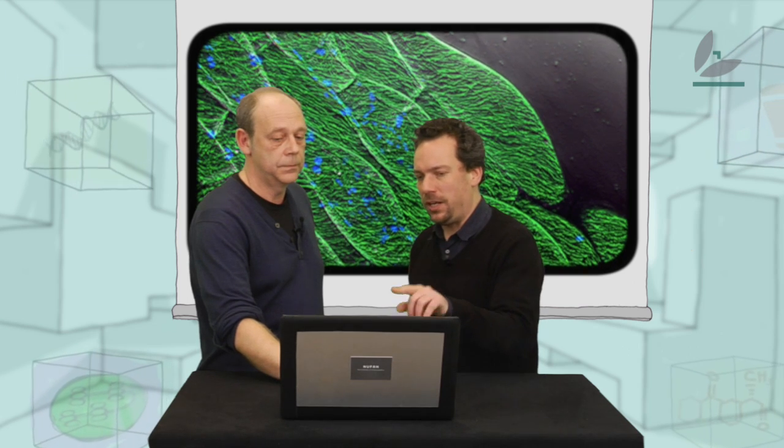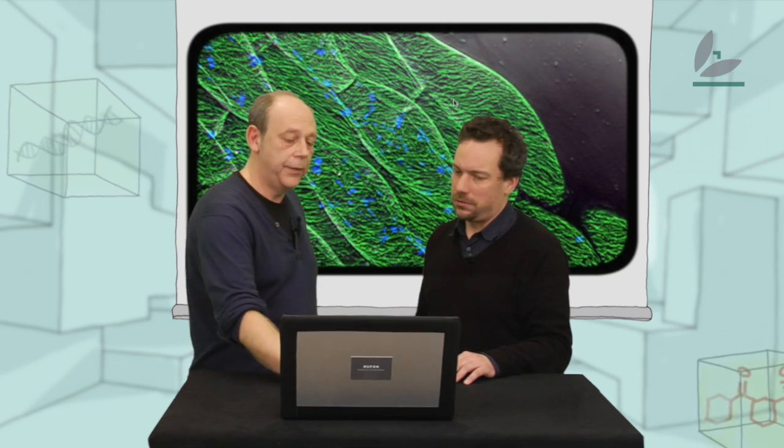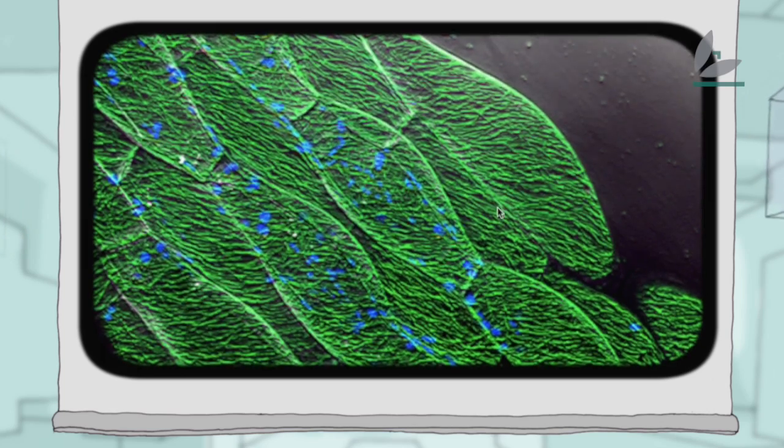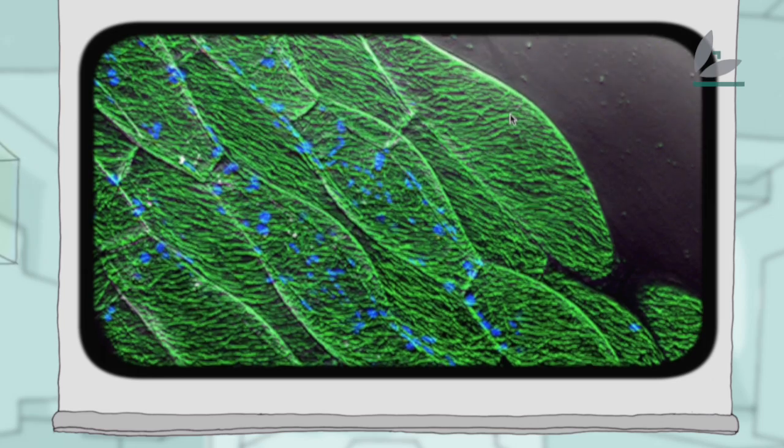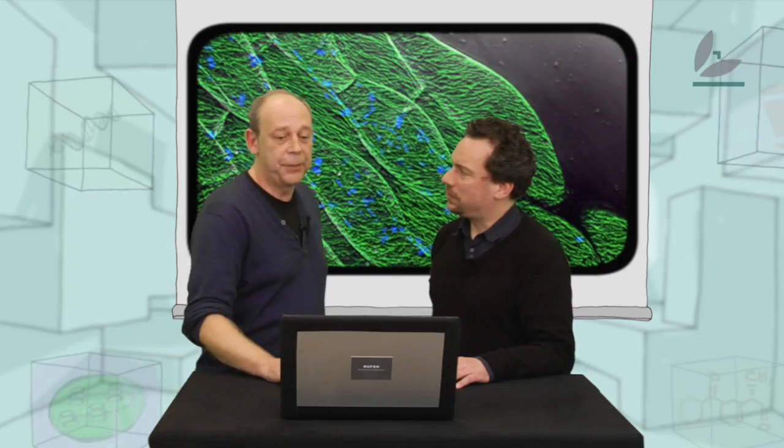And you have linked this protein with green fluorescent dye, right? Exactly. And what you see here is the localization within the cells. So this is an epidermal cell. And this fine structures you see here, which are green, appearing as green fluorescent filaments is actually the cellular cytoskeleton where this protein is associated. So this is what you find out via this picture that this protein is coupled, linked to the cytoskeleton. Yeah. This was a surprise for us because at this time, we did not know that the cytoskeleton is responsible for virus defense.